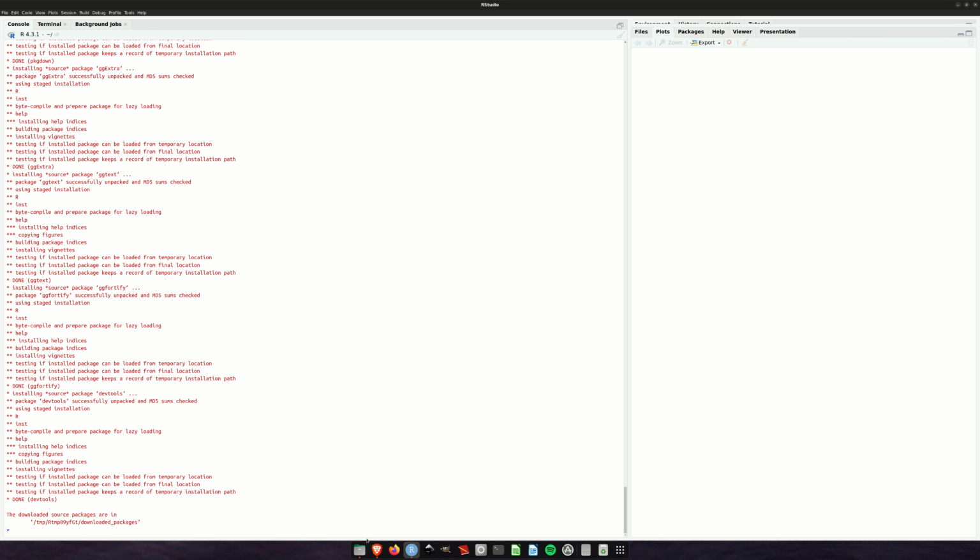Great, so we're done installing all of the dependencies. When we see this little caret here, that means it's done. Looks like we finished with no errors.